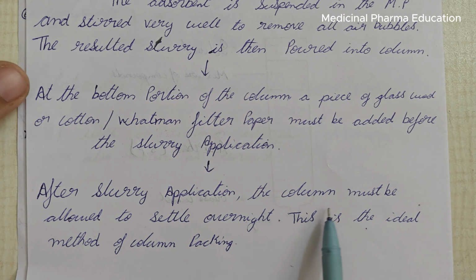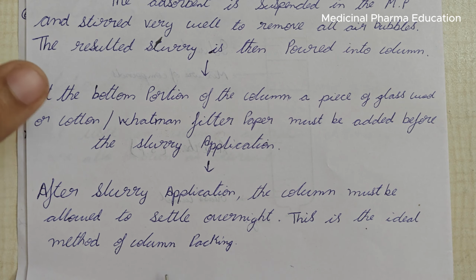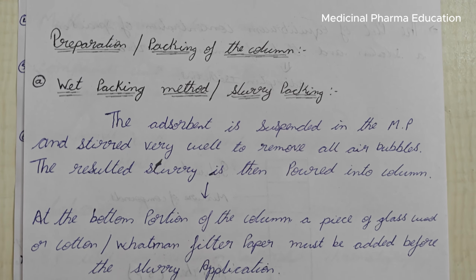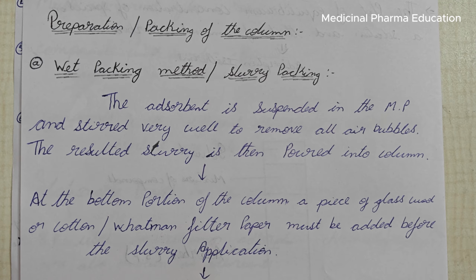After slurry application, the column must be allowed to settle overnight. This is an ideal method for column packing. Then we introduce the sample.